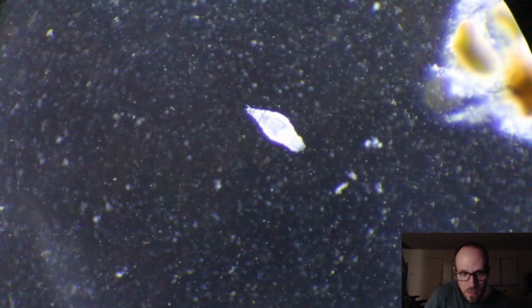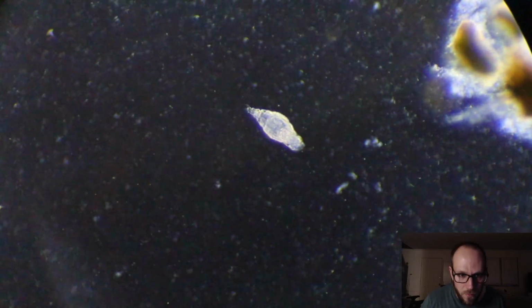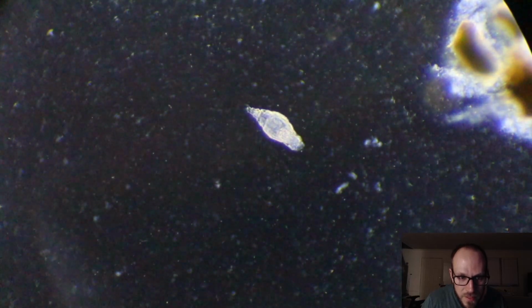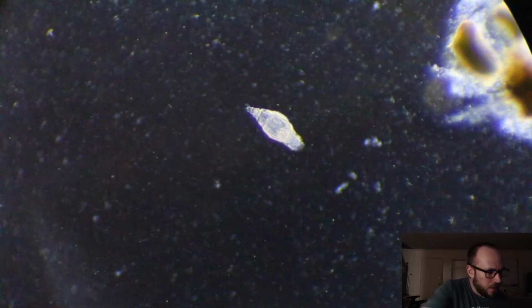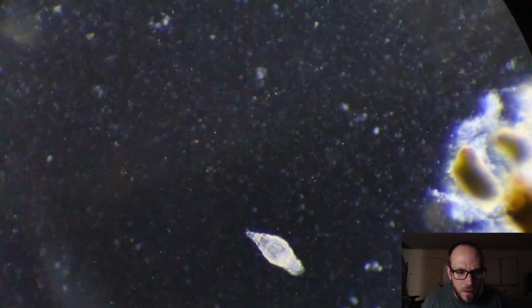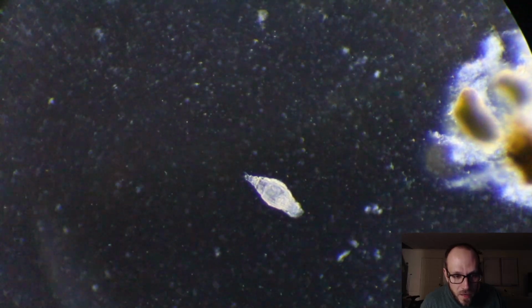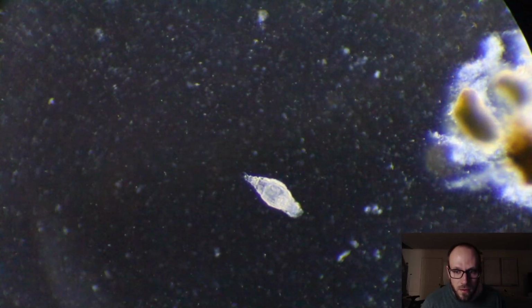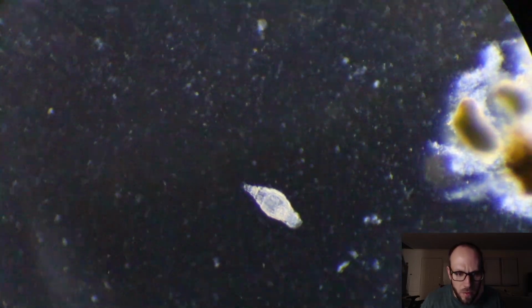Okay, so this is a Rotifer. And he looks pretty unhappy. There we go. I think he's dead. I'm going to tap the microscope, see if he's dead! It's a dead Rotifer. Well, that sucks. Wonder what killed him.